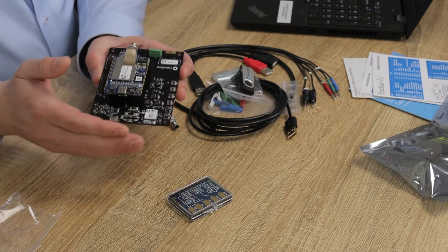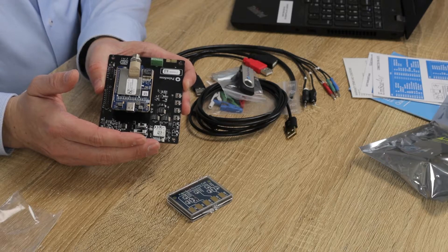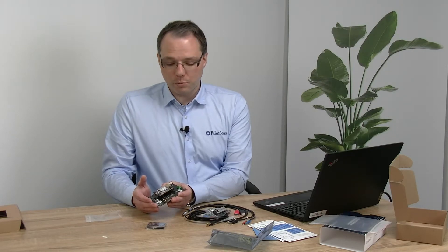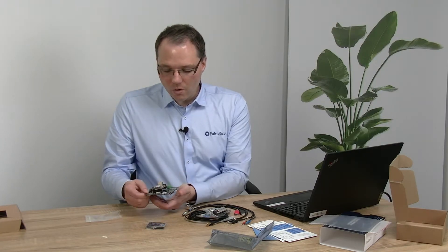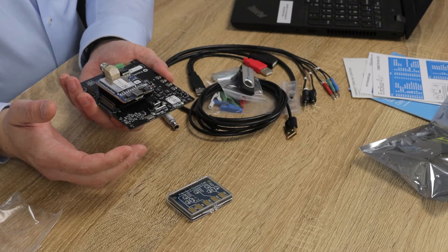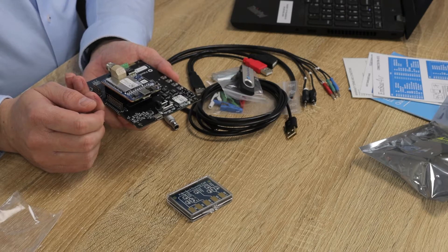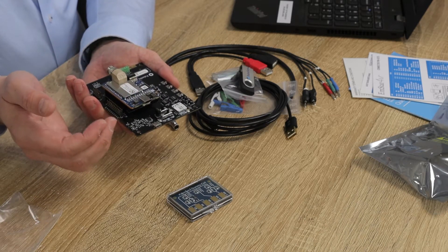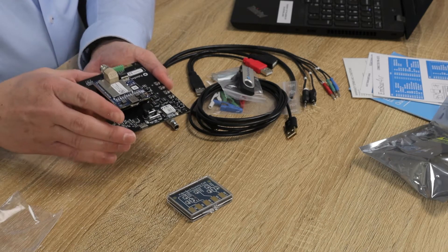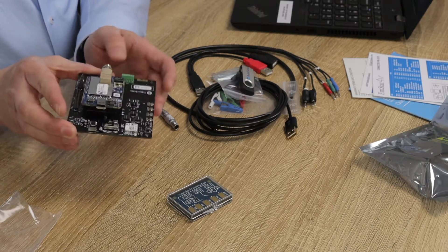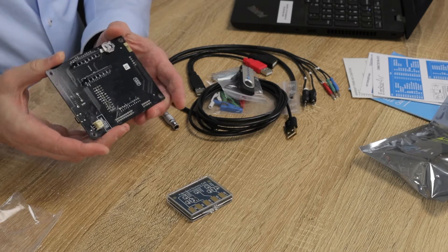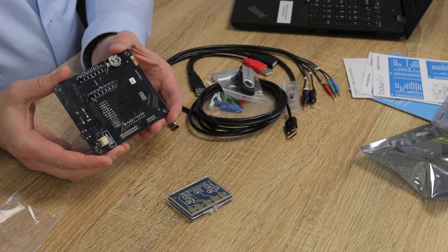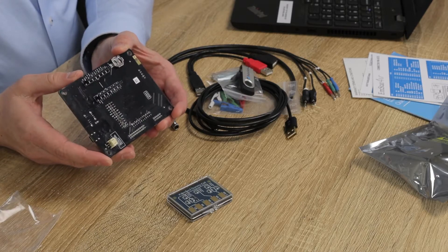Yes, there's already a pre-installed Bluetooth module on the board. So if you have a software programmer that wants to make a wireless application, they can get started immediately. There's a USB plug that you can use to communicate to the board or the USB plug of the potentiostat module to talk directly to the potentiostat module. How you want to communicate or which source of power you want to use can be regulated with these switches. You can also connect a battery to your potentiostat because at the bottom side of the board is a connection for a lithium-ion battery. There is a port for an Arduino microcontroller.